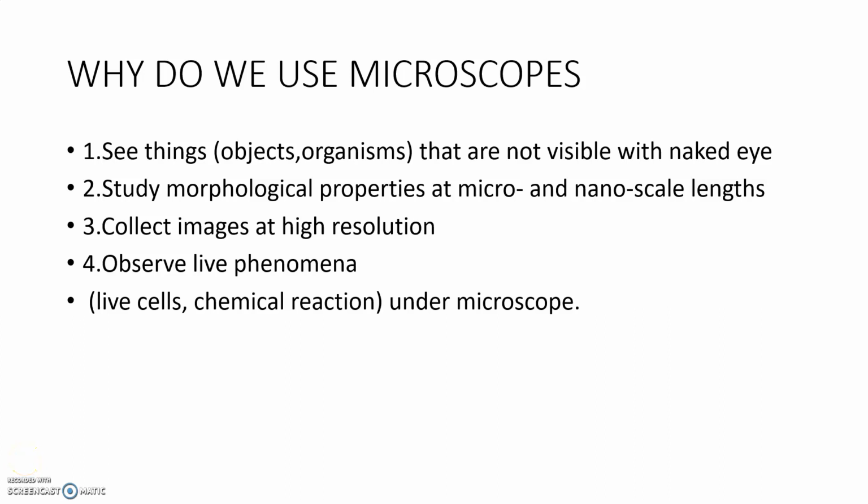Good morning all. Today we are going to discuss a new topic, that is microscopy. In the previous sessions we have discussed growth, factors affecting growth and various methods for the measurement of growth. So from now onwards, today we will discuss microscopy.